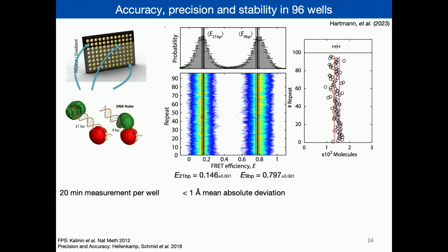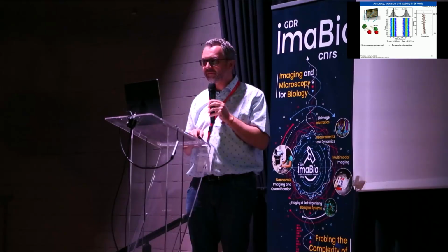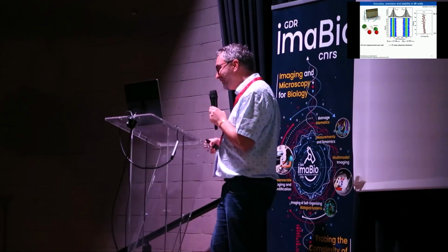And what was more impressive is that when we start our experiments, we typically in these 20 minutes acquire 1,500 molecules. When we end our experiments, we typically acquire around 1,500 molecules. And this is over a time course of 32 hours. That's still a very long experiment, but it is fully automated, so nobody has to sit there, nobody has to exchange solution every 30 minutes. Tough student.